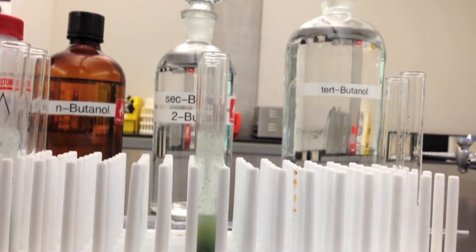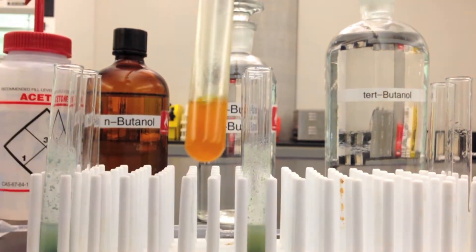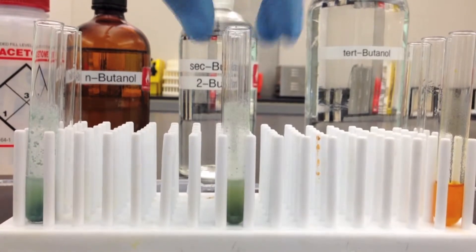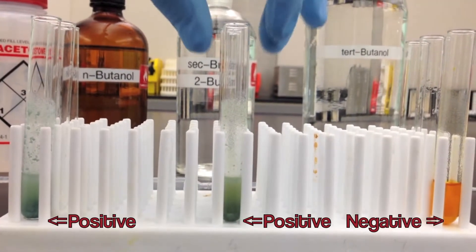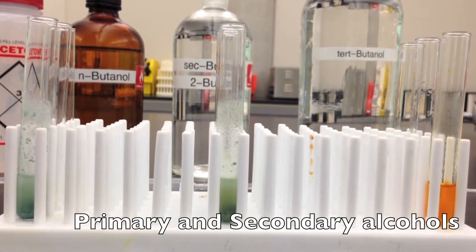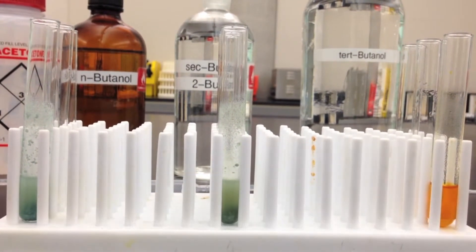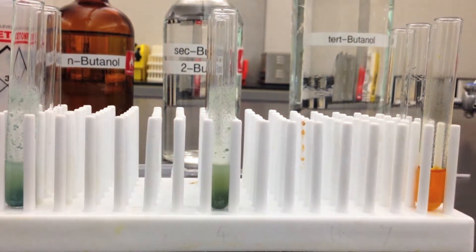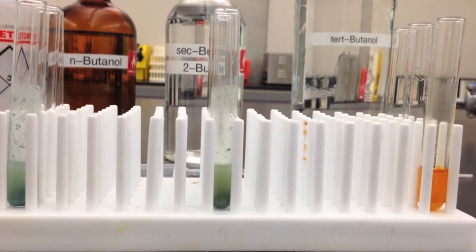This orange, this is considered a negative result. Because the chromic acid, if it had added to the alcohol group to create an aldehyde would have turned green. And that only happens in primary and secondary alcohols. So these two we can assume are either primary or secondary. And this one we can assume must be the tertiary, since it did not react at all whatsoever.